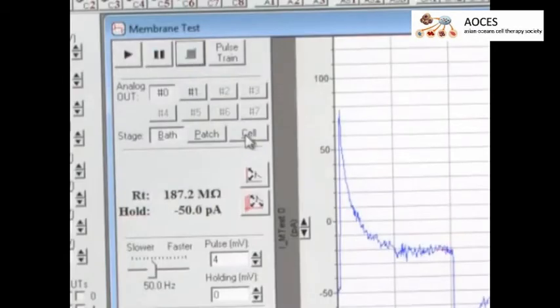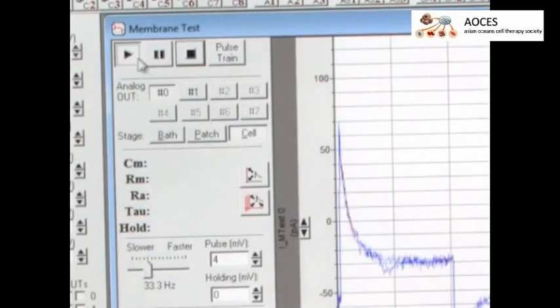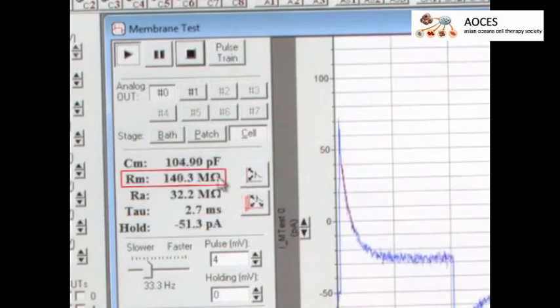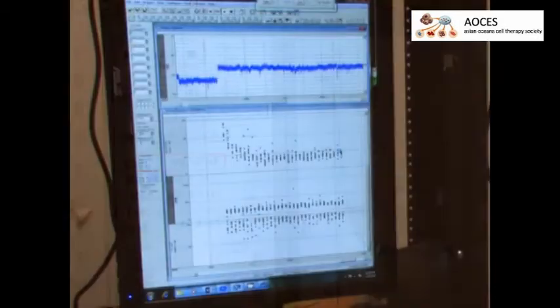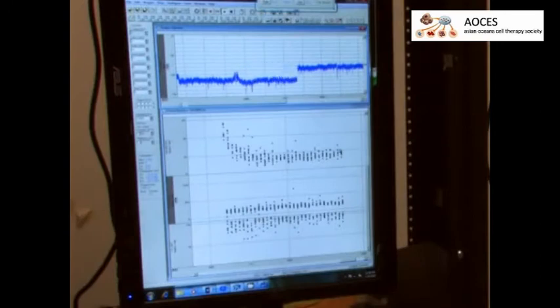Switching to cell mode in the membrane test, view different parameters of the cell, such as input resistance, series resistance, and membrane capacitance. After achieving the whole cell configuration, continue to monitor these parameters during recording.